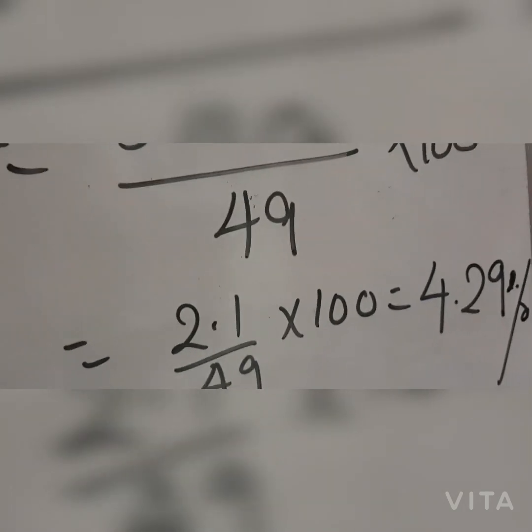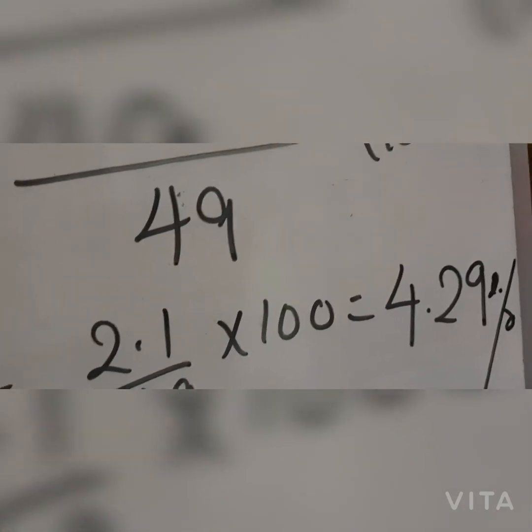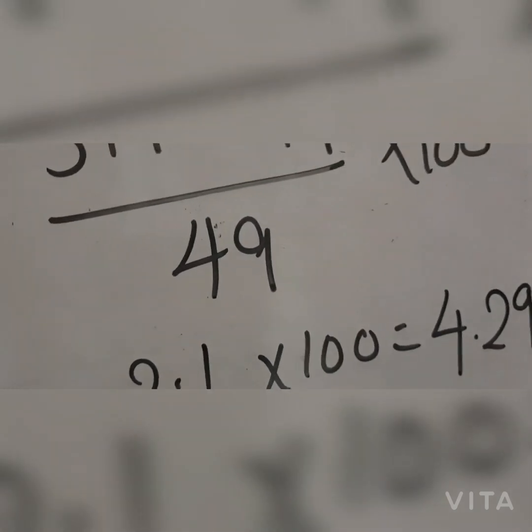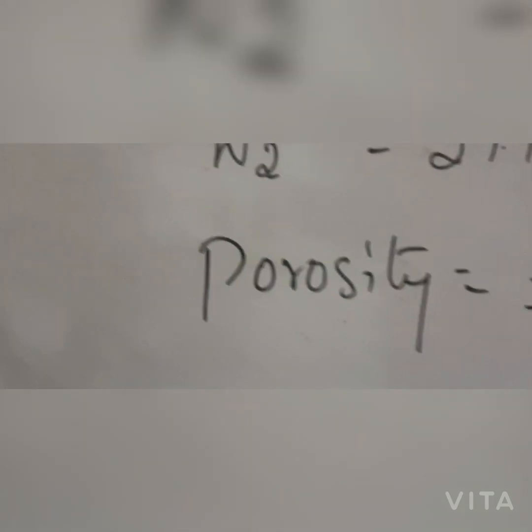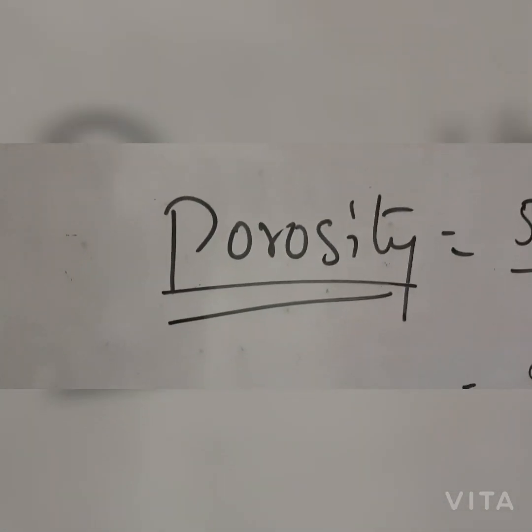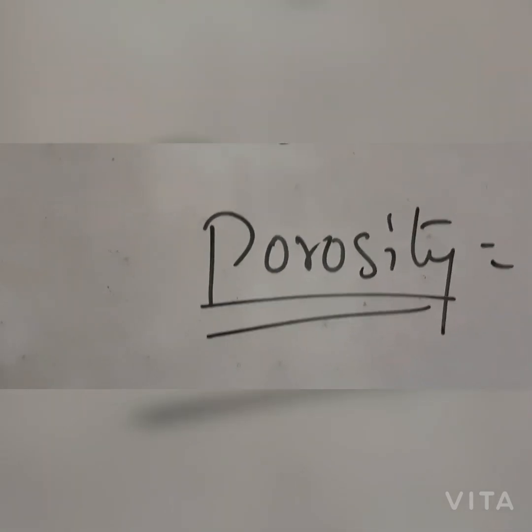Okay, so the porosity of the given sample is 4.29%. Hope you understood this experiment, determination of porosity of a given refractory sample.